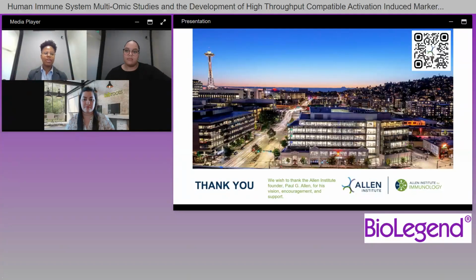But also the fluorescence algorithm is able to normalize the fluorescence intensity of the cells based off of cell size, which helps keep our MFI data from being skewed, and for it to be consistent and reliable.